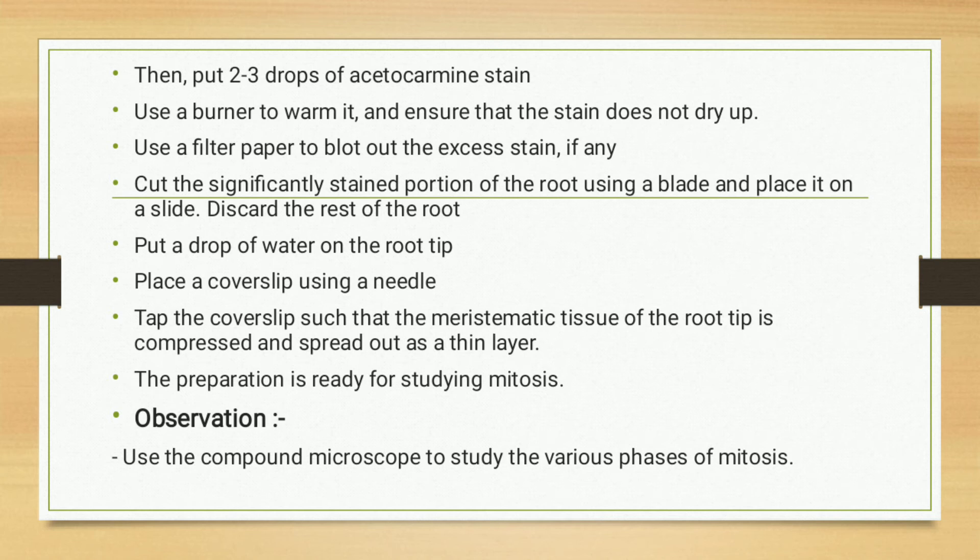This is how to prepare mitotic cells from onion root tip cells. For observation, use the compound microscope to study the various phases of mitosis.